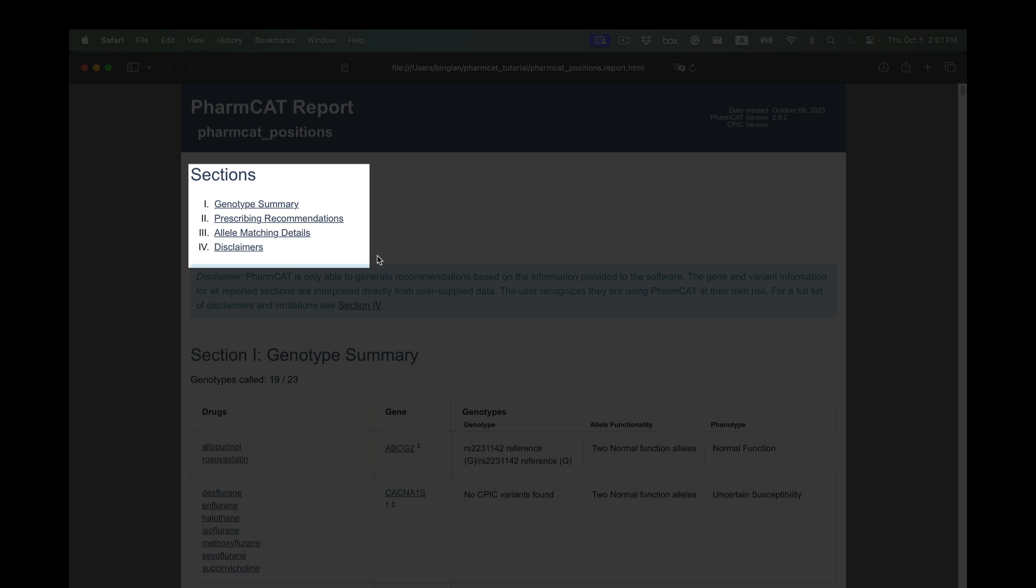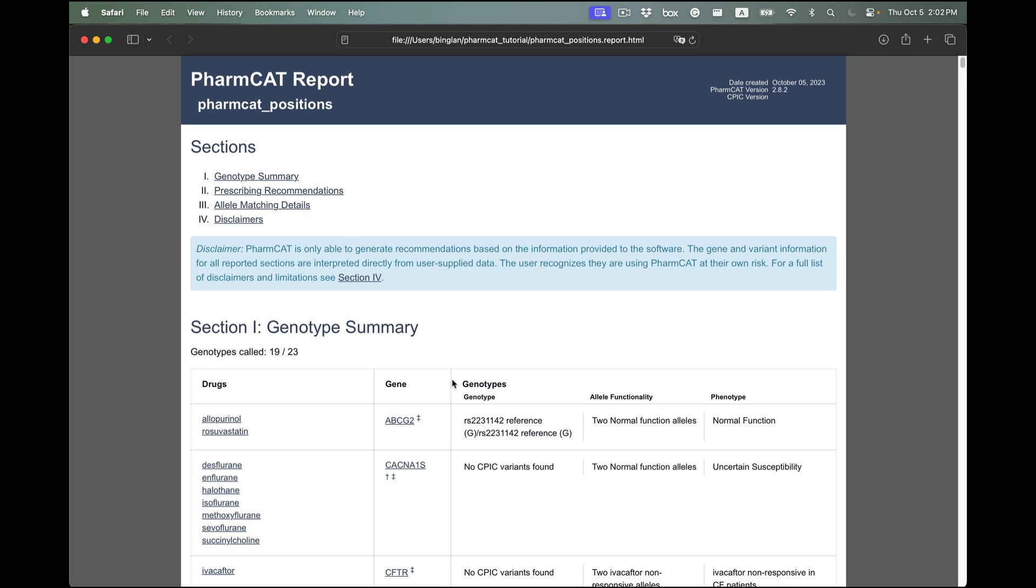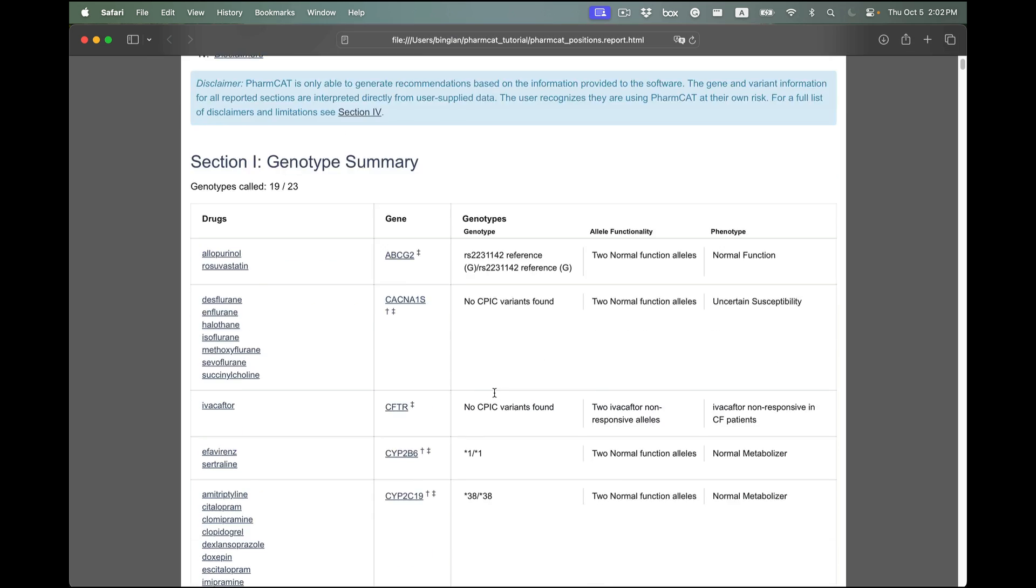the genotype summary, the prescribing recommendations, the allele matching details, and the disclaimers. The genotype summary section shows an overview of the gene-drug pairs and their genotypes.